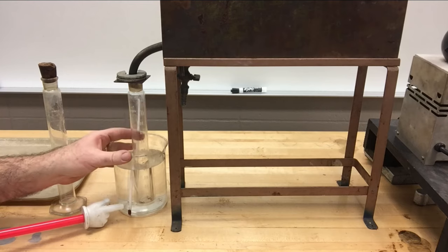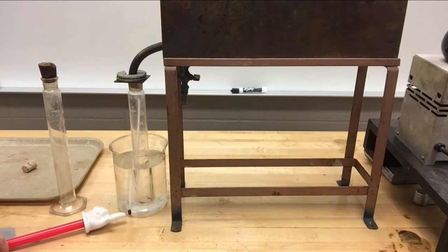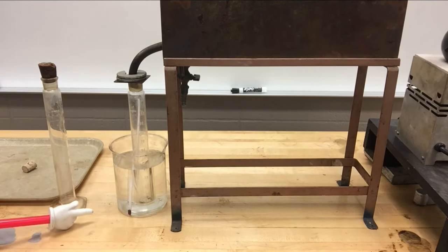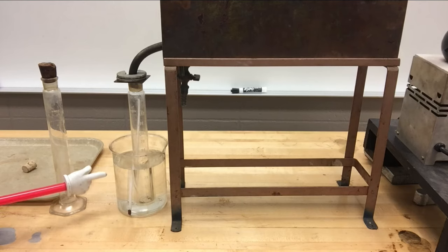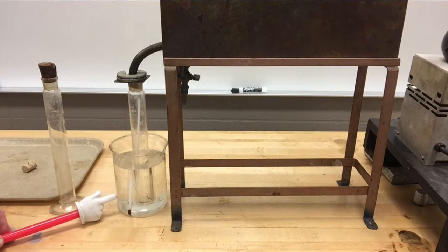As soon as it starts dripping, it's going to get going pretty quick. If I take a look at my thermometer over there, it's about 175 where we're currently at, and we still don't have anything at all. So again, this is a pretty heavy sample of crude oil. If I was pulling this out of the ground, this is like a field test they would do real quick, to see how much of this crude oil is heavy versus light. And this particular sample is pretty heavy crude oil. There's not a lot of light gasoline in this. Oop, I just saw a drip. I just saw one little drip. Let's see if we can get another one going.